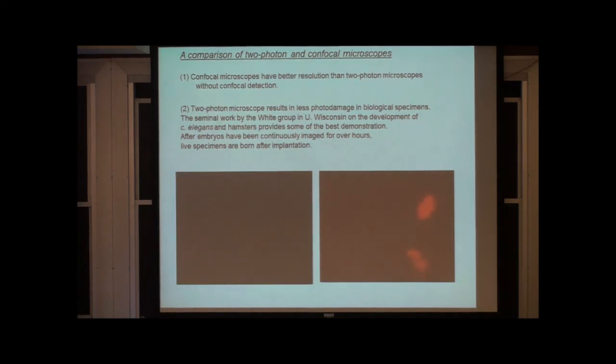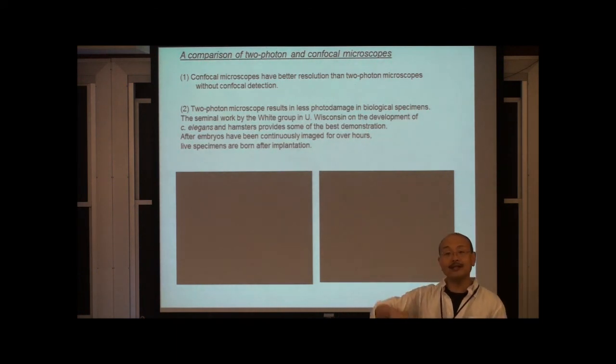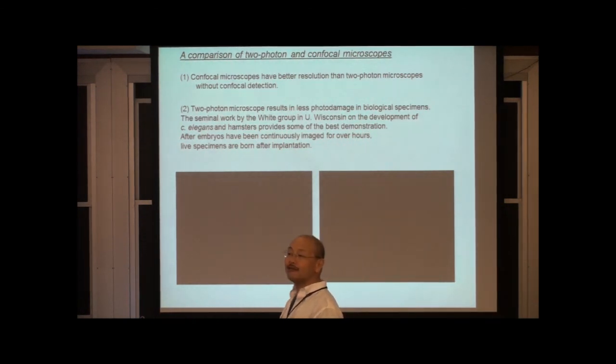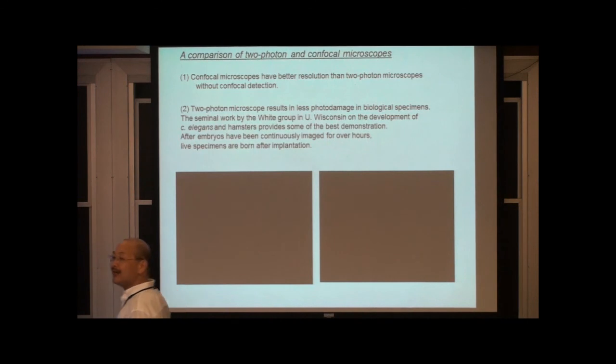You can see that one of the disadvantages of UV microscopy, just using a normal mercury lamp, is that it is quite damaging. The reason is that you are sending high energy radiation throughout the organism, and that generates a lot of reactive oxygen species that damage proteins. And that kills the euglena.